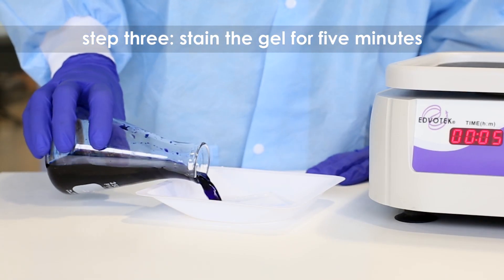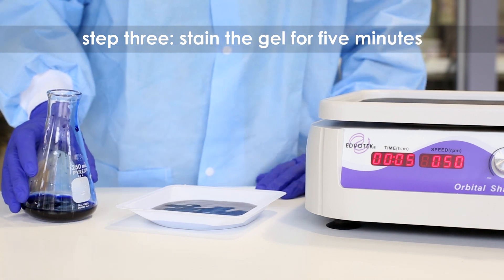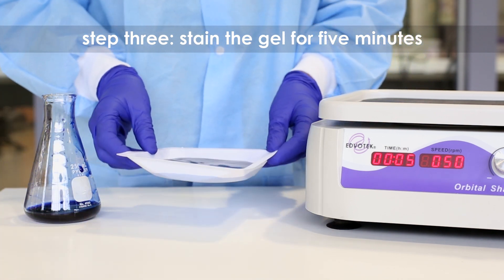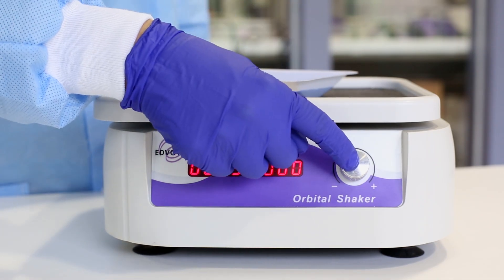Step 3. Submerge the gel in the Flash Blue Stain Solution. Stain the gel for 5 minutes. For best results, use an orbital shaker to gently agitate the gel while staining.